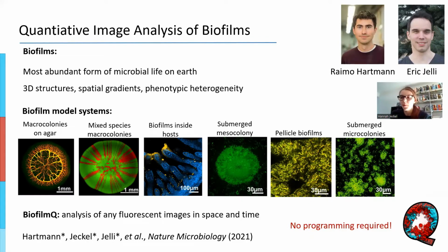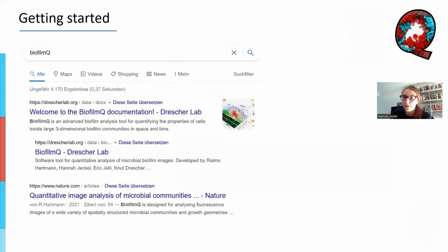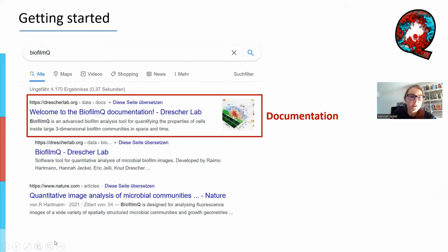You can download it from our webpage, which I'm going to show you in a second. And in fact, let me show you right now. So if you Google BiofilmQ, this is what comes up. We have at the top here this documentation that we made, which I strongly encourage you to check out at some point. It is really extensive. It contains so much information, and basically anything you need to get started with BiofilmQ.